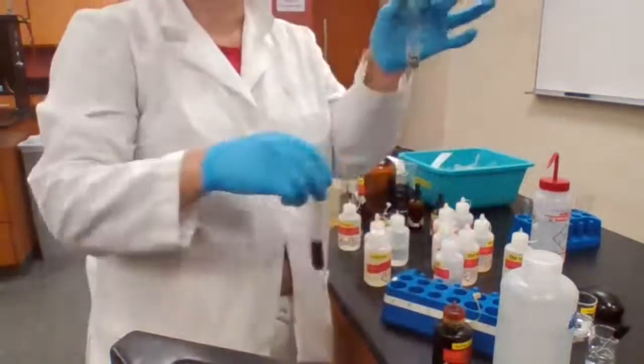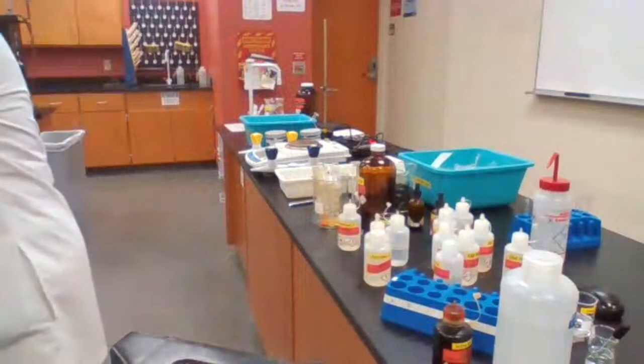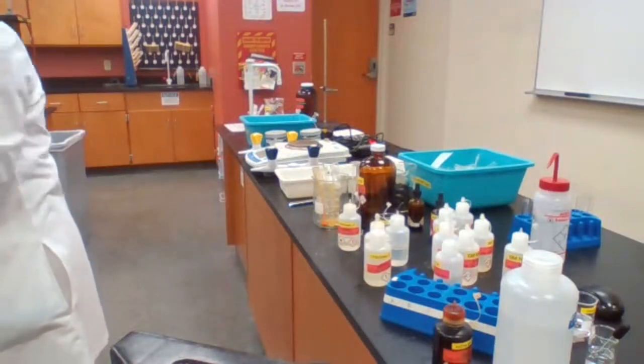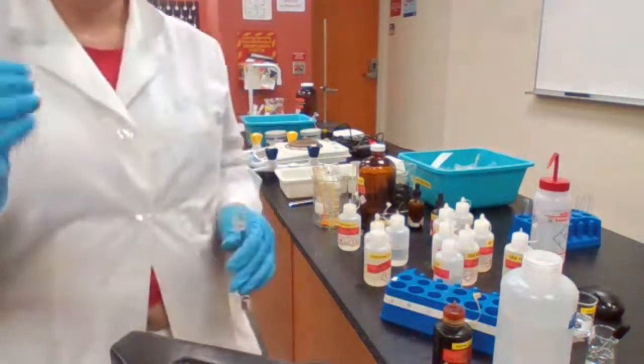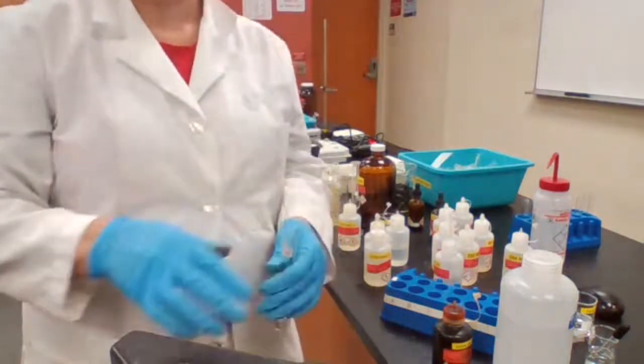A would be ketone, yes. A would be ketone, and D would be. Okay, I placed it in hot water, so you could actually see that silver mirror. Hopefully, you would see the silver mirror.